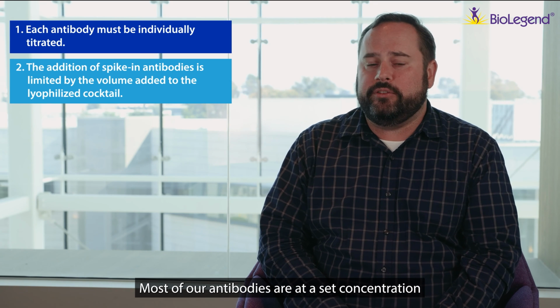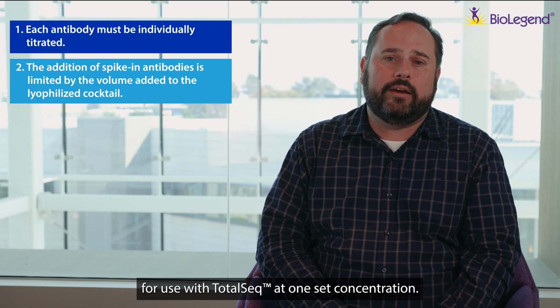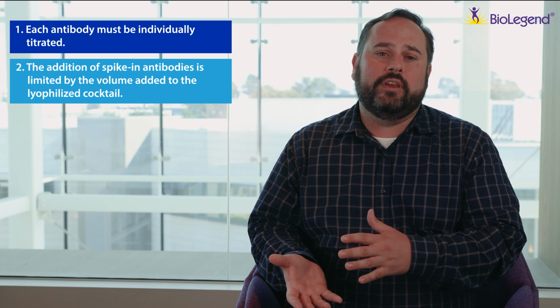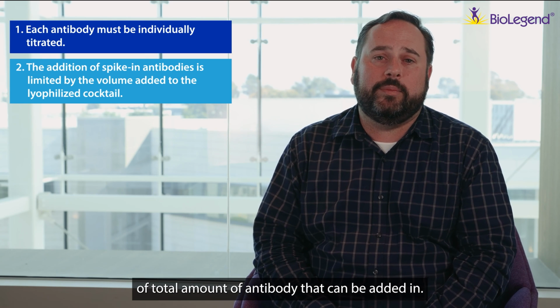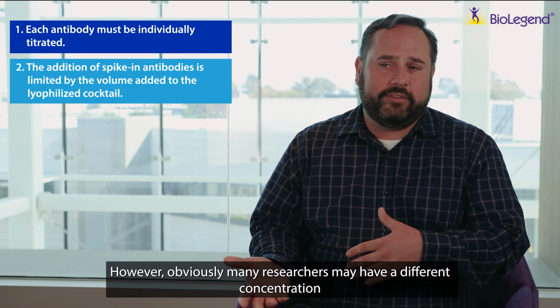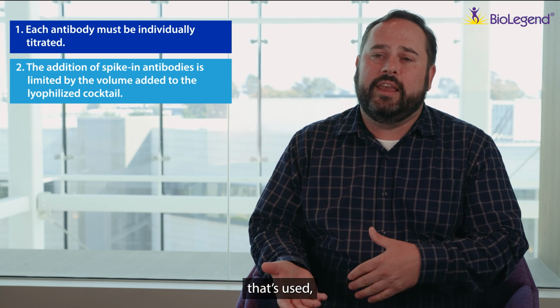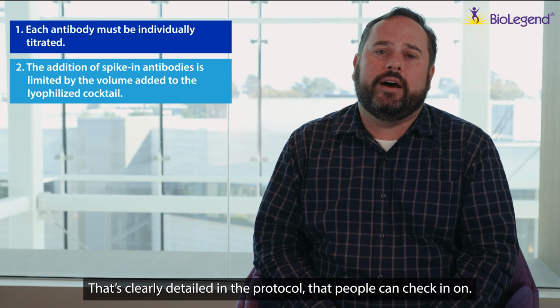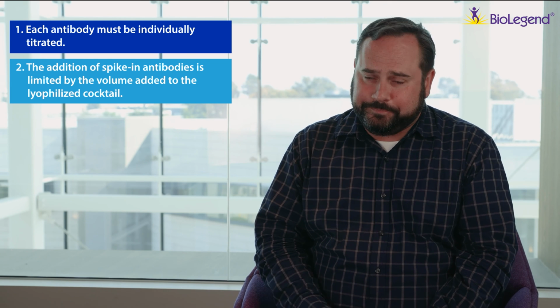Most of our antibodies are at a set concentration for use with TotalSeq at one set concentration. If you use that as guidance, there's about 12 to 13 micrograms total amount of antibody that can be added in. However, obviously many researchers may have a different concentration that's used, in which case it's not an amount that's a limitation, but the volume. And that's clearly detailed in the protocol that people can check in on.